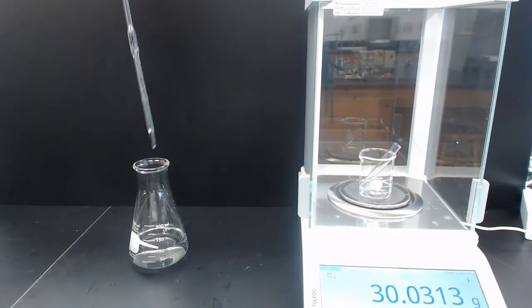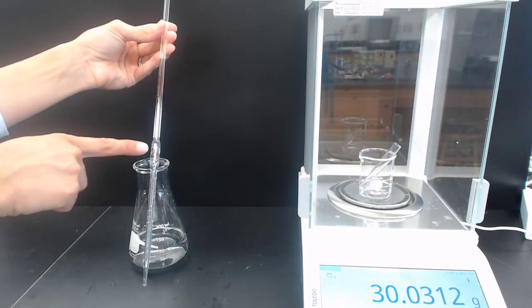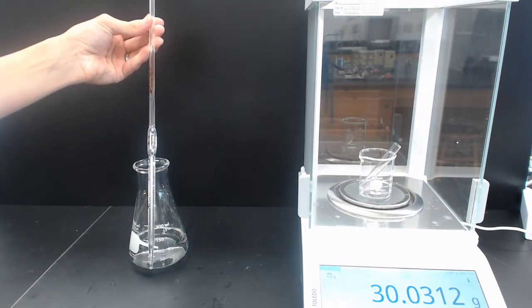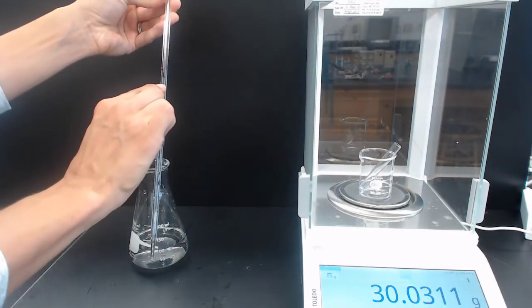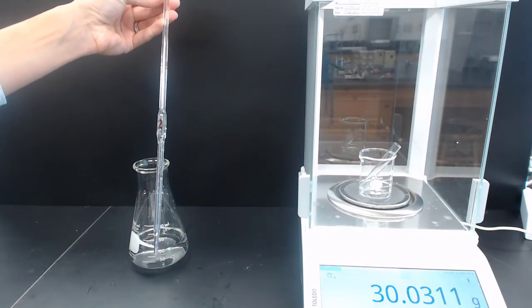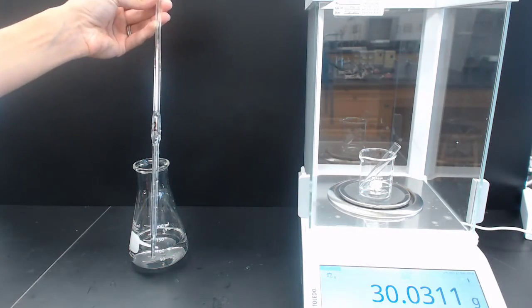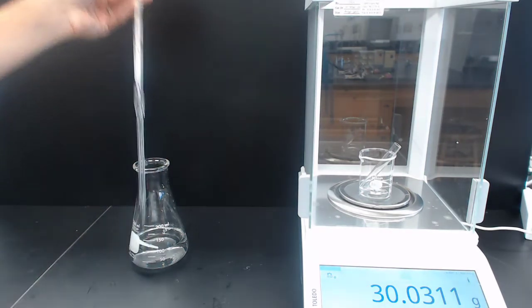So here is what's called a volumetric pipette. It only measures a very specific volume. In this case, it's 2 milliliters. There's a mark on the pipette here that shows the 2.00 milliliter mark. So it's calibrated for a volume of 2.00 when the meniscus is at that line.